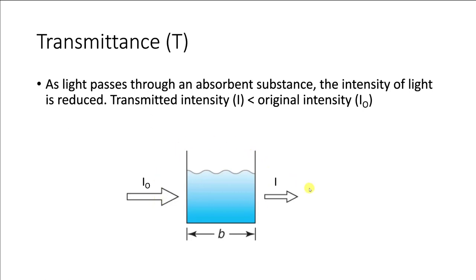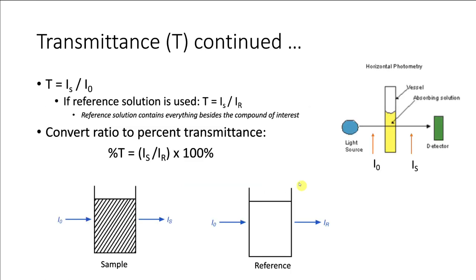If you think about curtains, right? What do we use them for? We use them to block out light that's coming in through the window. When we lower our curtain, the light is forced to pass through the curtain, and the light that gets transmitted through the curtain is reduced. So, you know this concept in daily life, but this whole concept basically describes how we measure stuff.